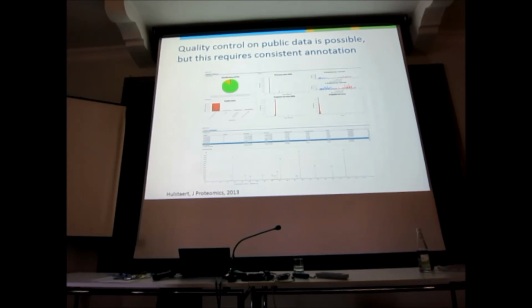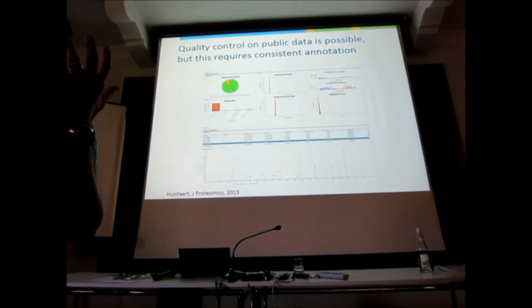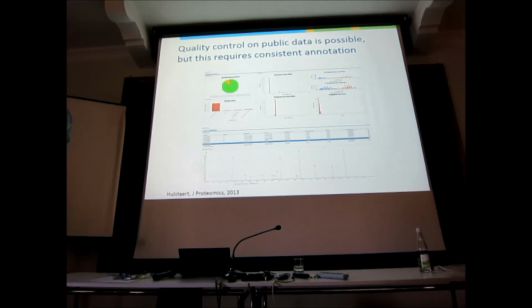Incidentally, we spent 7 years building this thing, hence the whimsical name ASAP. It's automatic spectrum annotation pipeline, but it also has a different meaning. We spent 5 out of the 7 years compensating for the lack of metadata that people submit. This is the biggest problem with the data. It's because people are too lazy to invest the 1 day. My guys have to work 7 years to get all of that fixed in a reasonable way. To be honest, it's getting a lot better nowadays.